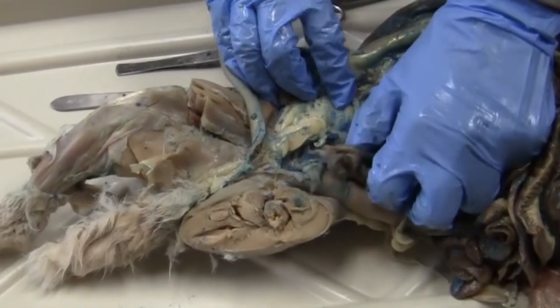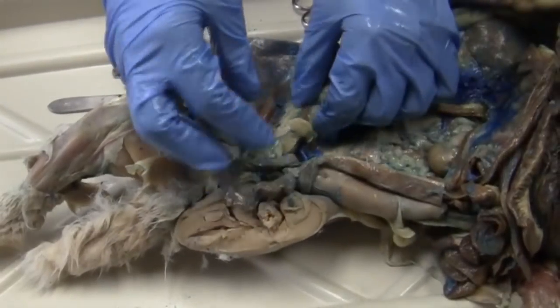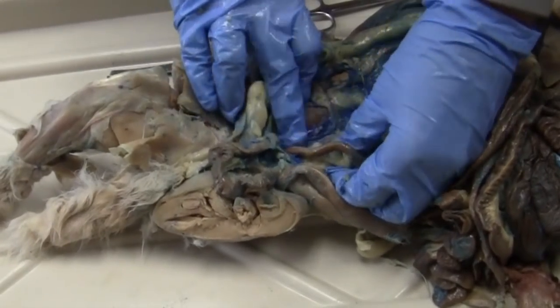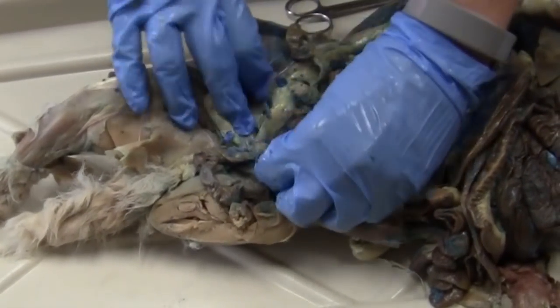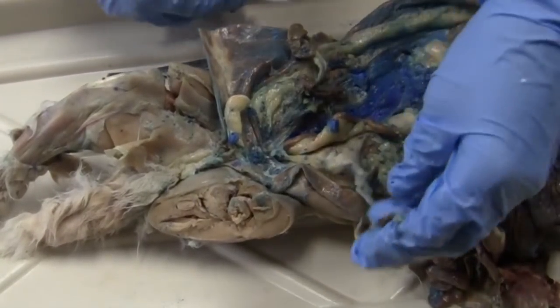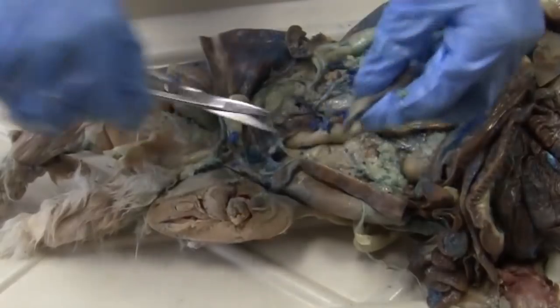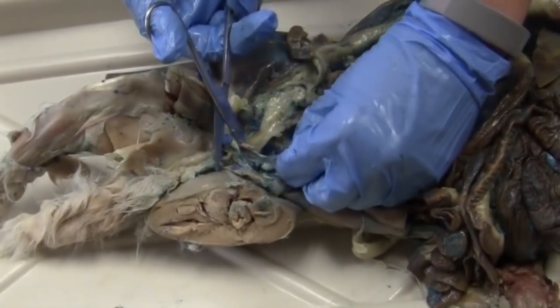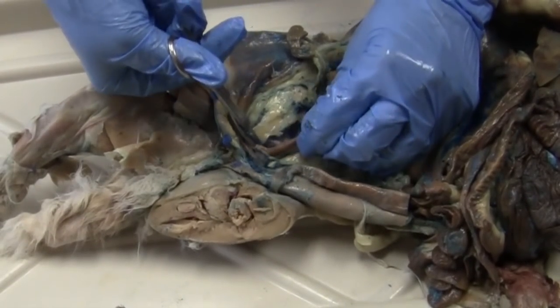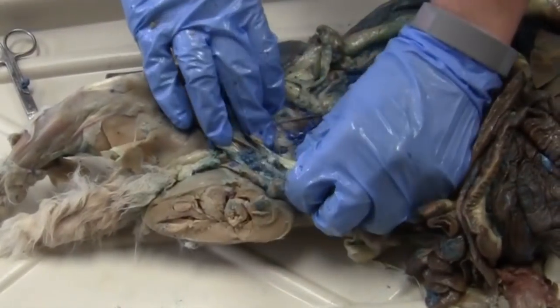So the next few that I'm going to show you are actually going to require you to do a little cutting. The next arteries and veins that we're looking for are down here on the back, on the dorsal side of the animal. So what we're going to do is take my scissors here and cut out some of this fat. You are going to take your scissors and cut off the last part of your colon. So we're going to cut this out. You don't have to cut very much out, just enough to clean this area up.